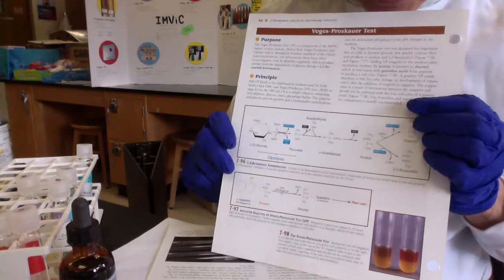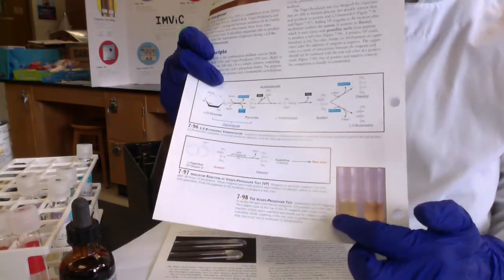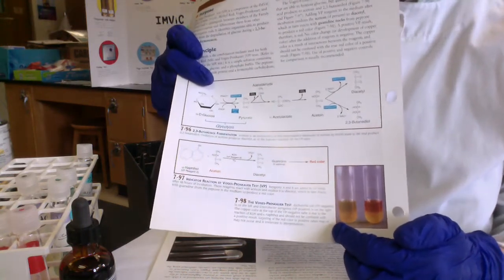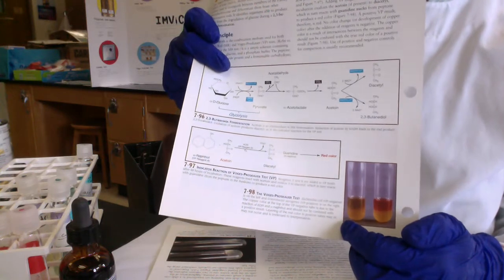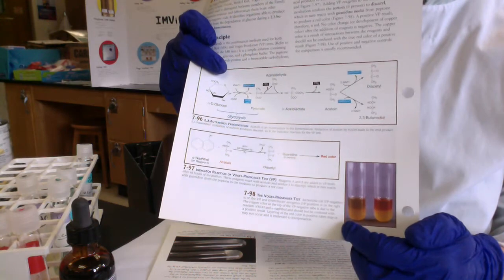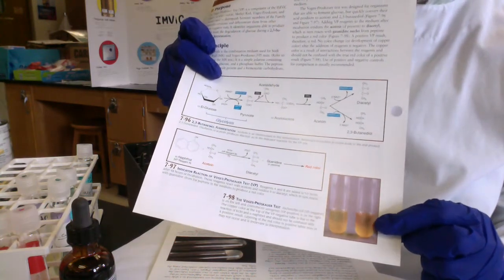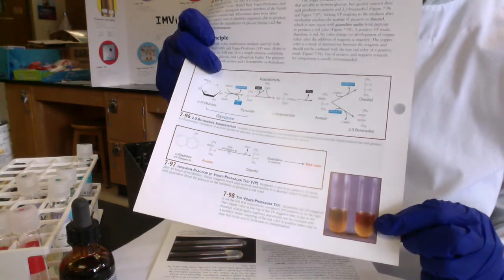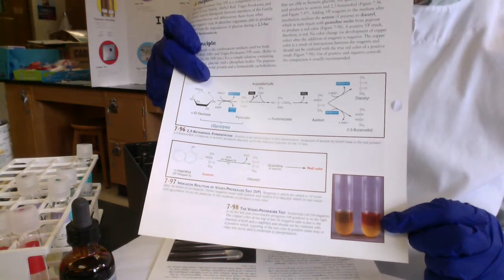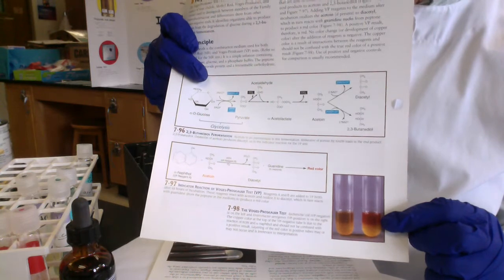So folks, if we added our alpha naphthol and 40% potassium hydroxide to our E. coli VP broth, there should be no color. And this is telling us that E. coli does not use butylene glycol fermentation, also known as 2,3-butanediol fermentation. In contrast, folks, if we added our VP reagents to our Enterobacter aerogenes tube, we would see a red color develop within 30 minutes.